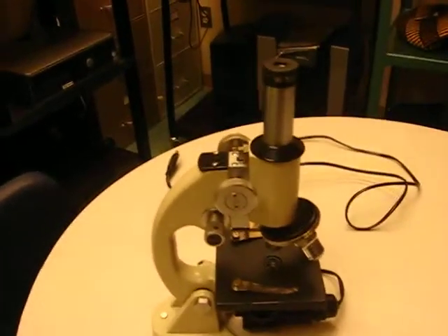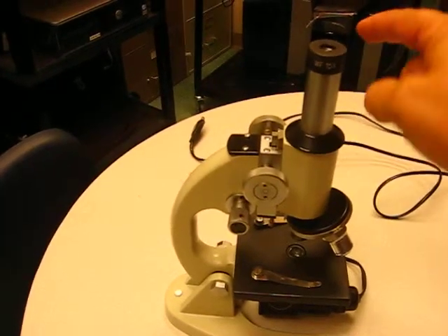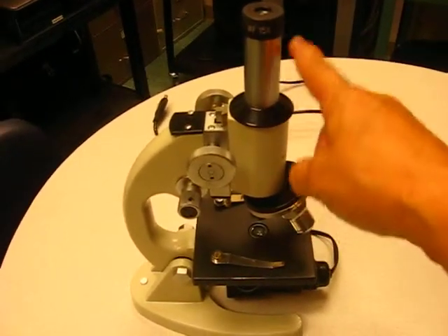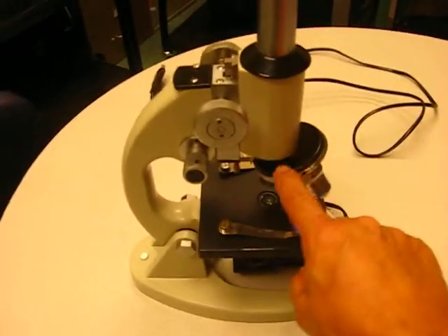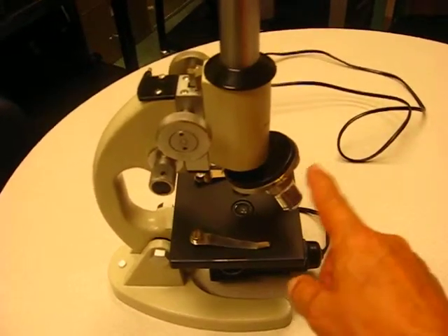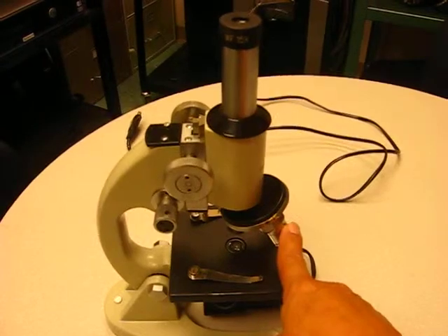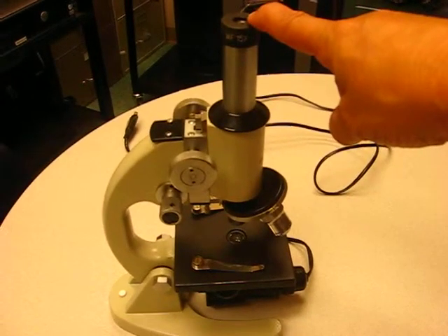Okay, here we have our standard microscope. The first piece up here on the top is your ocular lens or eyepiece, and that can come in different magnifications. This one is a 15x magnification. Then you have your focal tube, eyepiece tube, or body tube — called several different things. Then we've got the nosepiece, also called the objective turret, and these are the objectives — your magnifying pieces. They come in different magnifications. To get your total magnification, you take the objective lens power — say a 40x — and multiply it times the ocular lens, which is 15x, giving you 600x magnification.